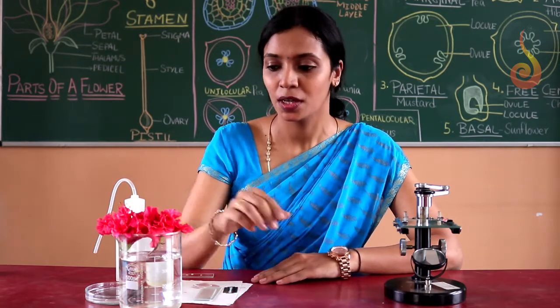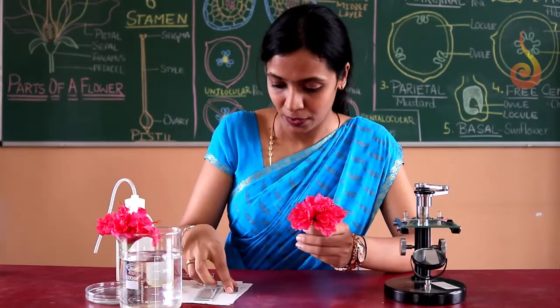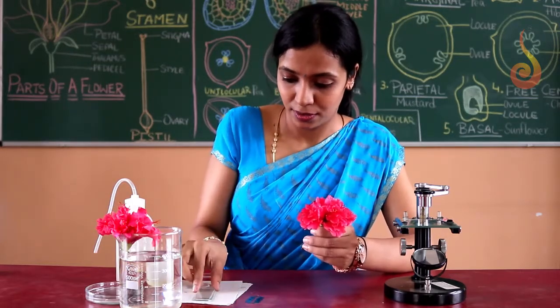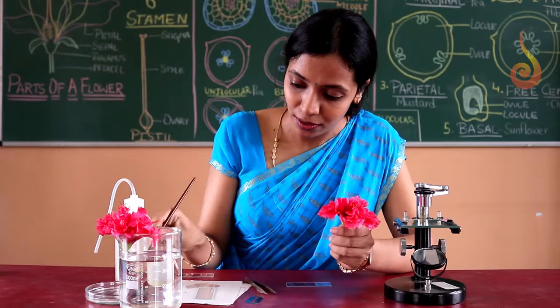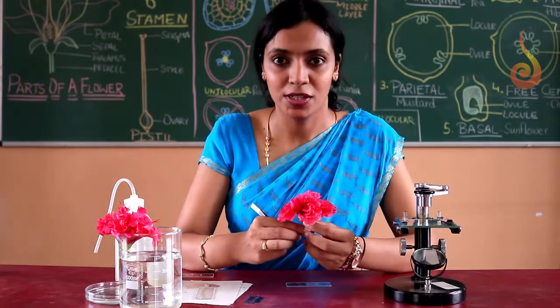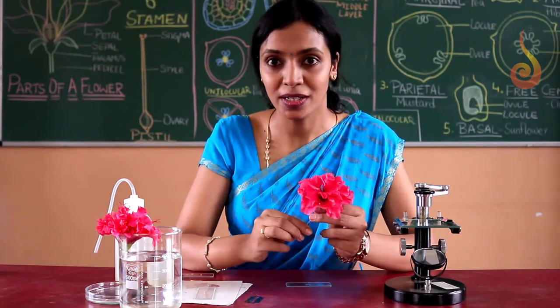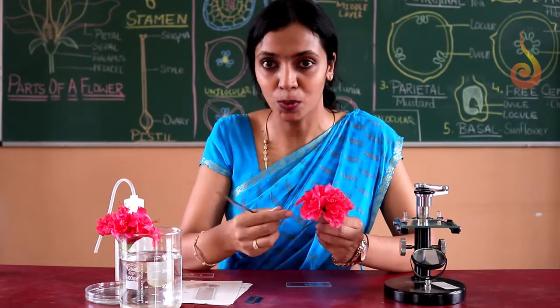What I am going to perform right now is one of the experiments that may be asked in your final practical exams. The experiment is called transverse section of the ovary. What I will need to perform this experiment is a hibiscus flower, a sharp blade, a slide, forceps, a brush. First, I am going to add a drop of water on the slide. First, you have to take the hibiscus flower and hold on to it by its pedicel. If you let the pedicel get cut, then it becomes difficult to take a section.